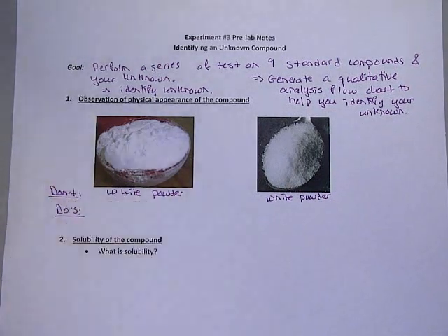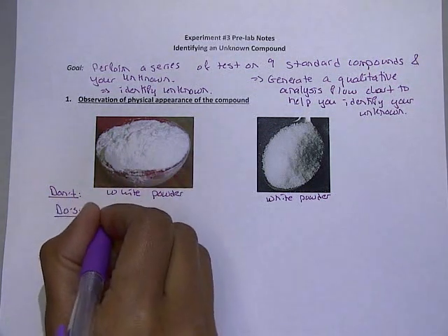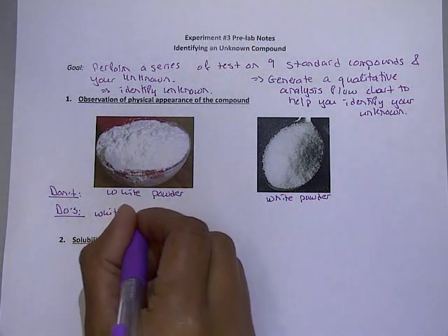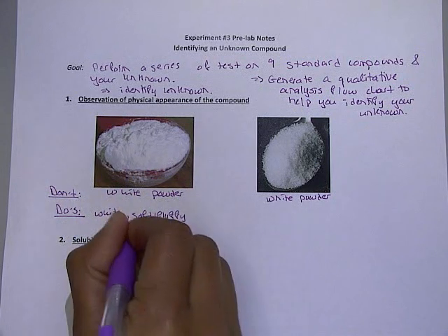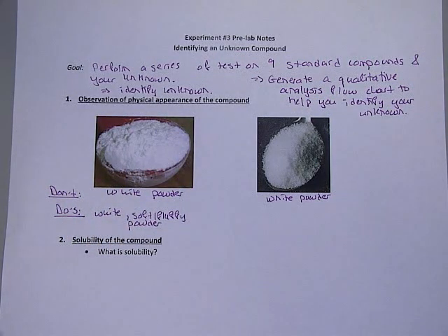Do's: what's the proper way to actually describe these 2 substances that are just white powders? Well, you're going to have these compounds in jars. I want you to turn the jars, shake them around, get a feel without actually physically touching the material. By doing so, this powder is definitely white, so I should write the color. It seems like a soft, fluffy powder. Think of baking powder. Baking powder is very soft and fluffy.